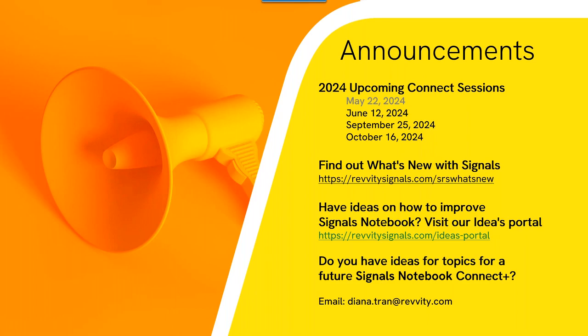That's definitely more detailed, like how would you actually model this? I am not always going to be the expert in the room, but we have people who can support that. I'll give you a quick example, not to send us in the wrong direction. Generally we want to be as parsimonious as possible. What I mean is we want to start with the least number of objects that connect to each other.